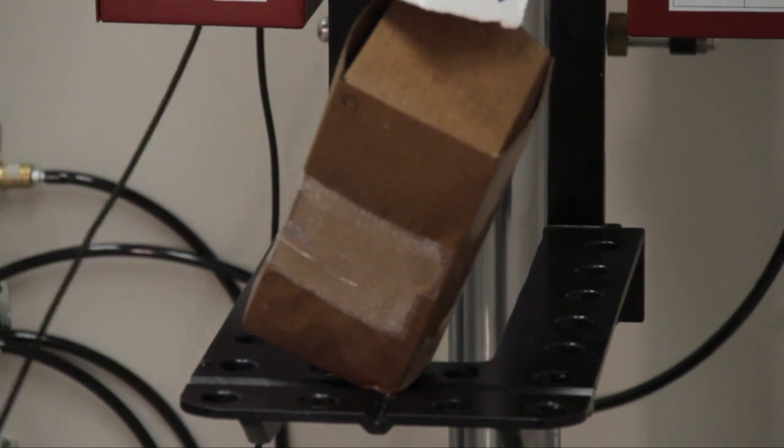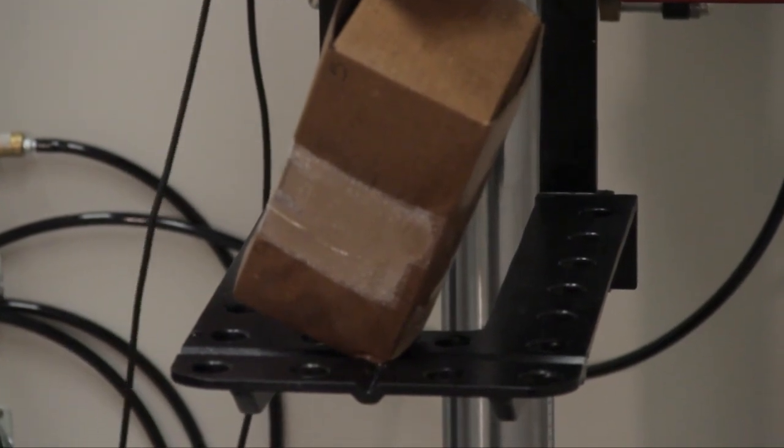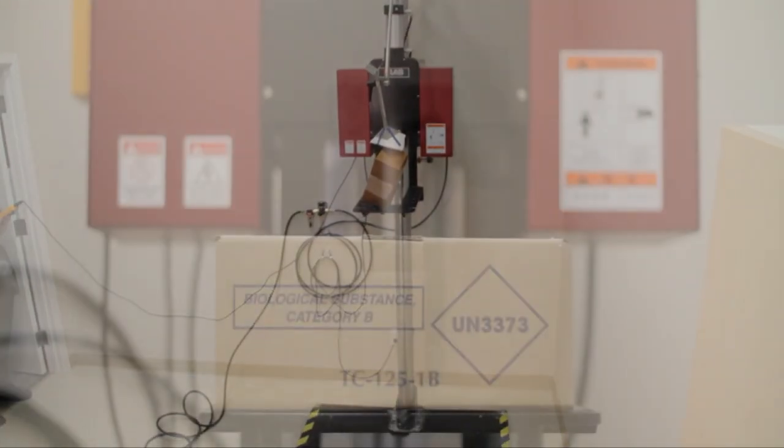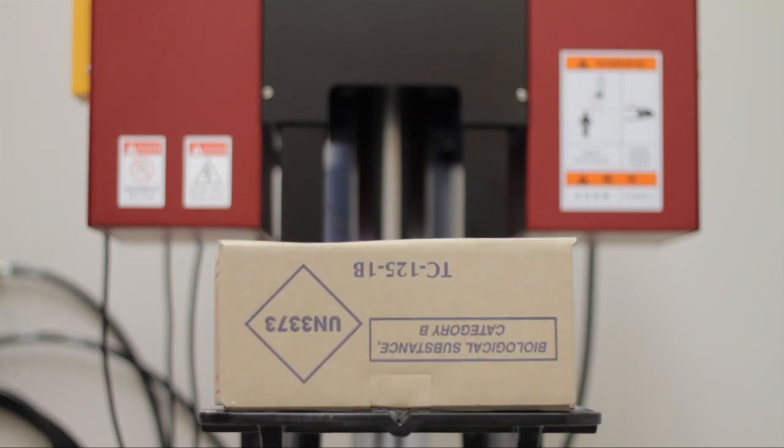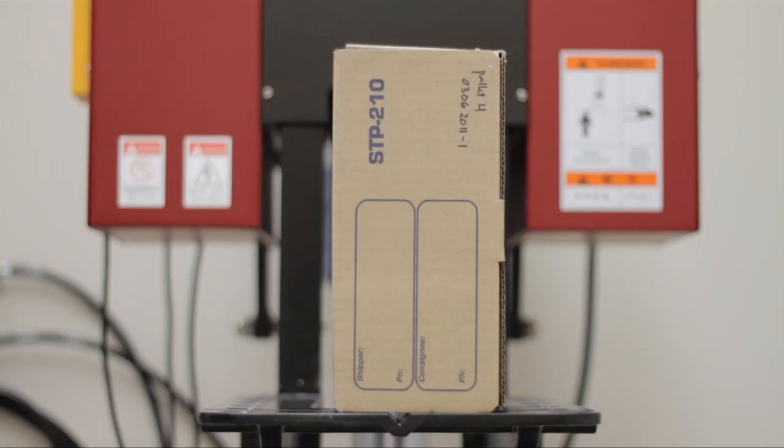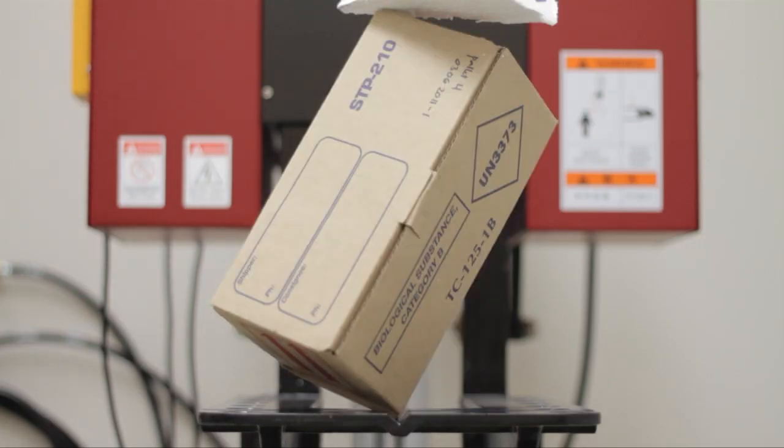Once the package has been conditioned, it must be dropped in five different orientations: flat on the bottom, flat on the top, on the longest side, on the shortest side, and on a corner.